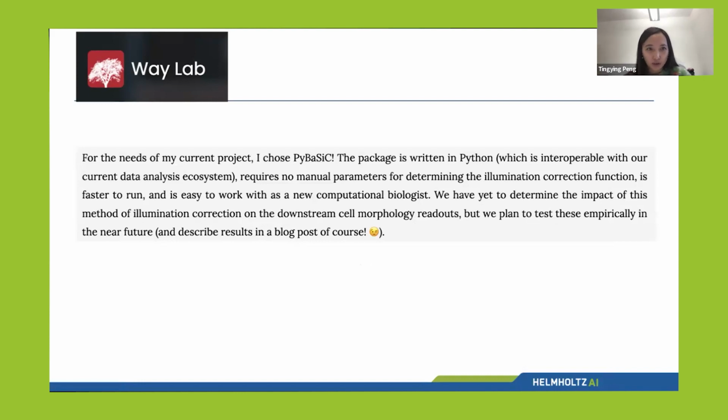We are also trying to finish our manuscript and submit to Nature Methods, and hopefully that can also get more people aware of our tool and learn to use it. So that's basically the end. I'm very happy to take questions.